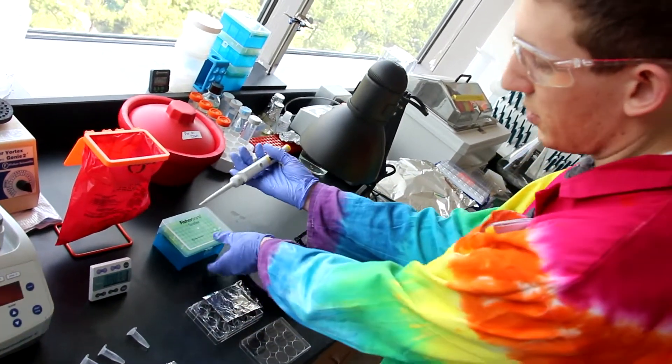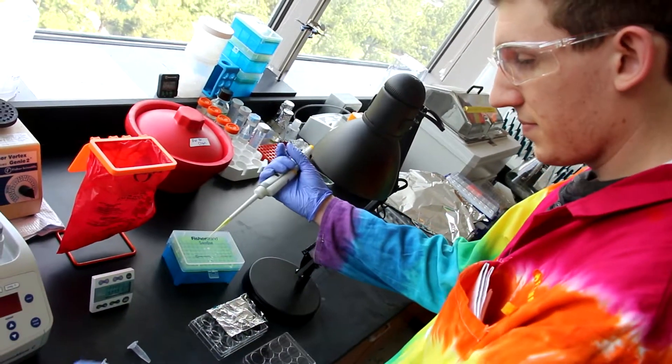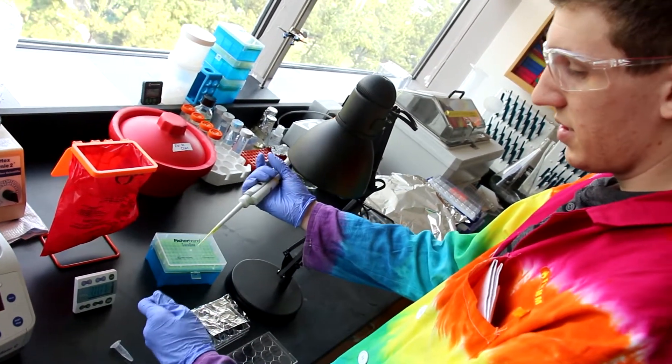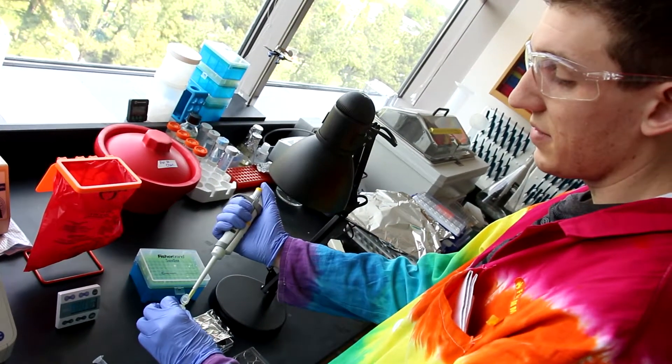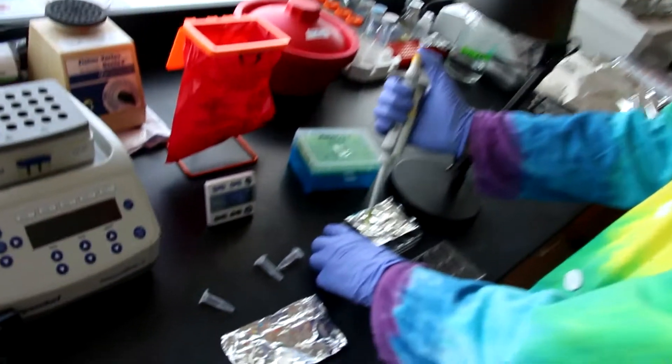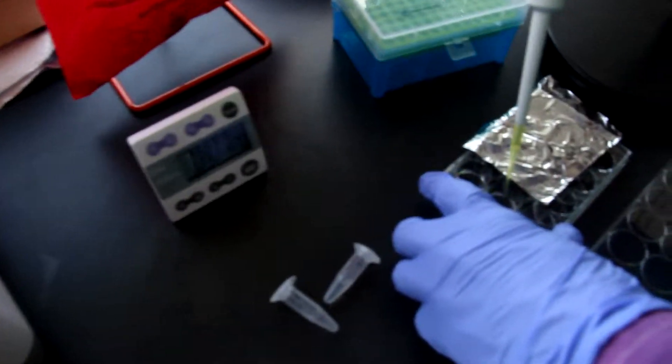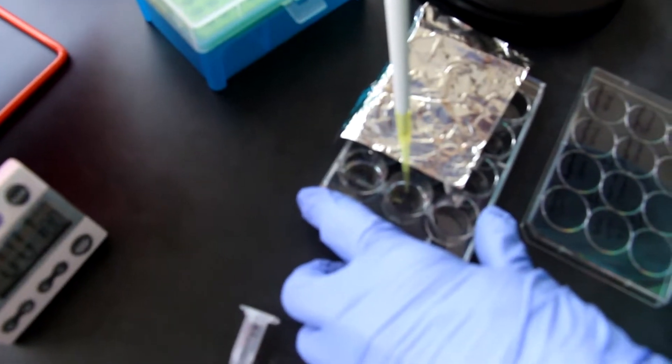You'll take a P20 pipette and add 20 microliters of your ATP positive directly to the center of the ATP positive well. Once you add it, count to five and then photoconvert for one minute.